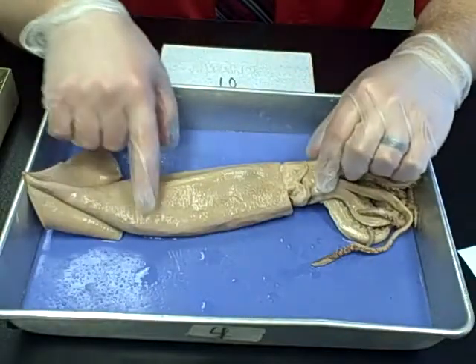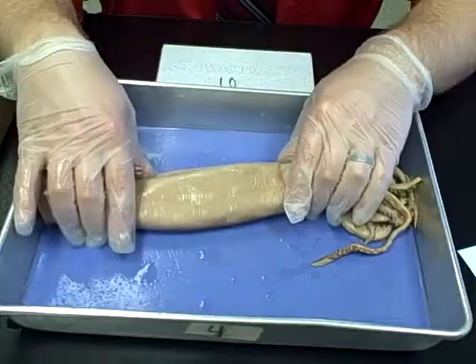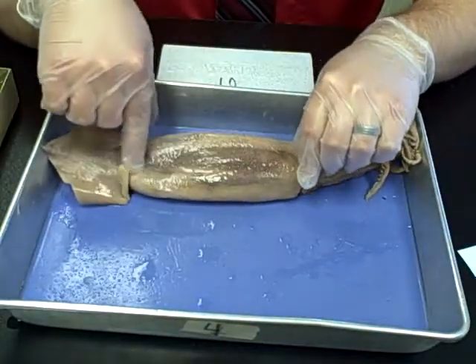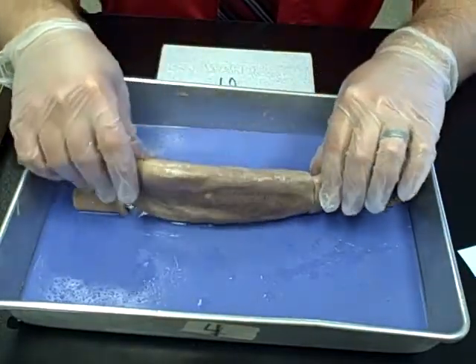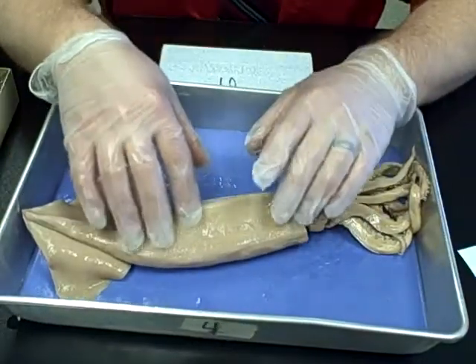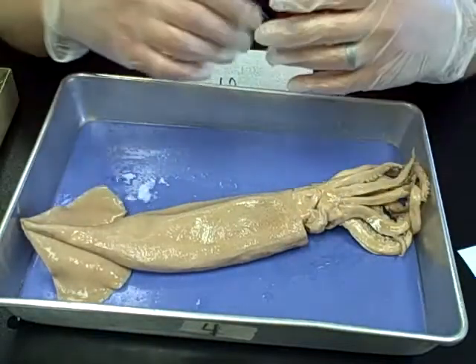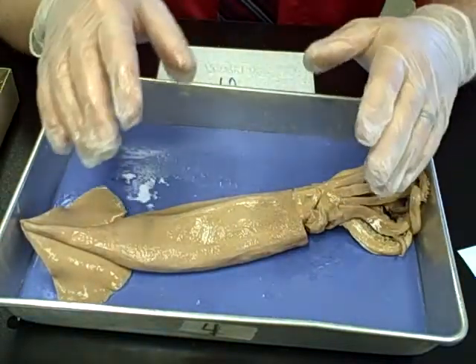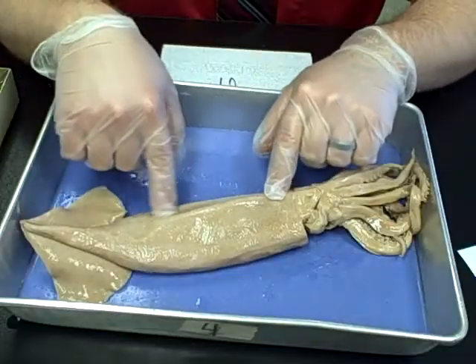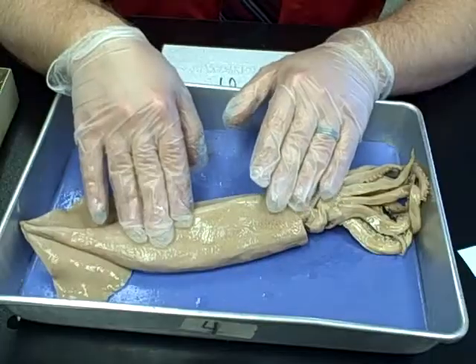If you take a look at your squid, you'll notice little brown dots on the outside of the mantle — this top portion here. What we're seeing are chromatophores responsible for the color change effect that squids have. They use this for camouflage and for attracting mates. It has many different purposes, but that's what you're seeing with those little dots on the outside.